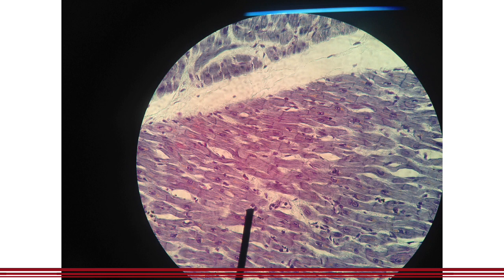Unlike skeletal muscle, cardiac muscles contain a single nucleus. Okay, they are uninucleate, meaning they only contain one nucleus per cell, unlike skeletal muscle, which have multiple. Also, unlike skeletal muscle, the nucleus is now located centrally. Okay, in contrast to skeletal muscle, where the nuclei are located in the periphery.